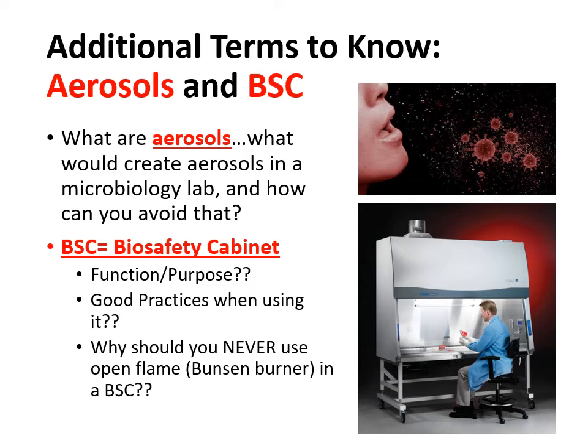Basically, when you're going to work with one of these, you make sure to turn it on right before you start your experiment to disinfect everything in there. You then can leave it on during your experiment and make sure to have it on for a little bit after to make sure all the surfaces and all of the items get sterilized or disinfected as well. And we're going to go over that kind of terminology more in the lecture.